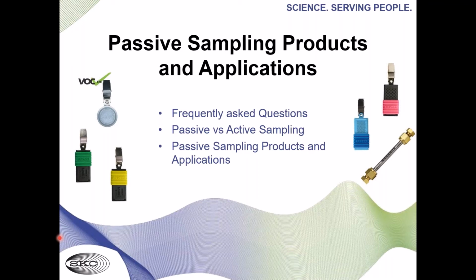I want to take advantage of some of Jay's technical information and the history and segue into some additional information about SKC's products and application solutions. But first, I want to cover some frequently asked questions and then discuss the difference between passive and active sampling.